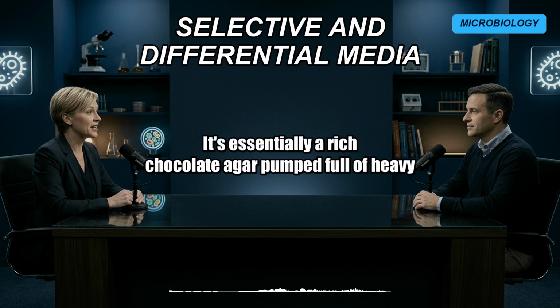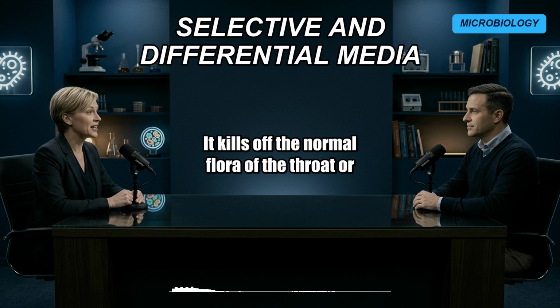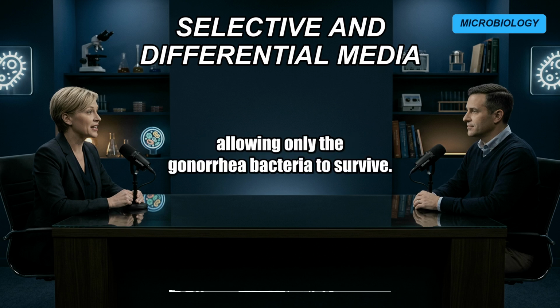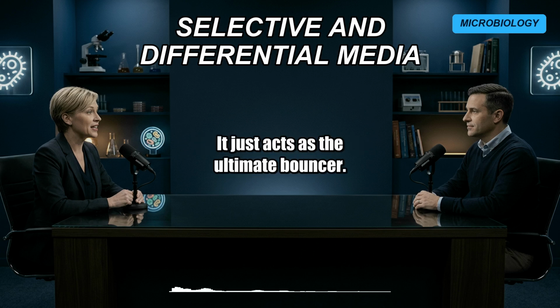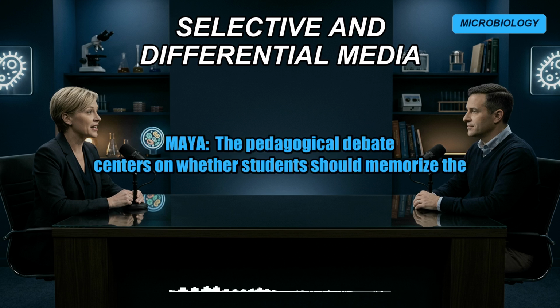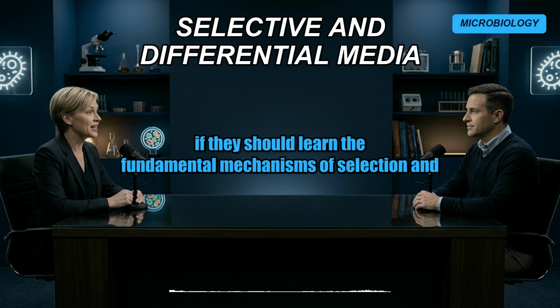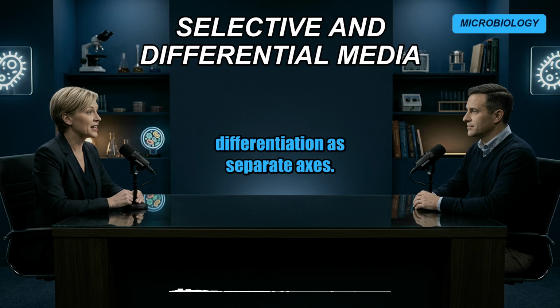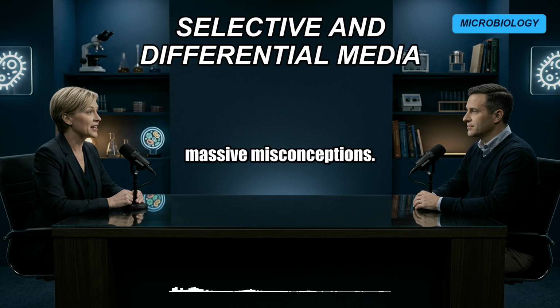It's essentially a rich chocolate agar pumped full of heavy-duty antibiotics. It kills off the normal flora of the throat or the urogenital tract, allowing only the gonorrhea bacteria to survive. But once it grows, there are no colored dyes. It doesn't differentiate anything. It just acts as the ultimate bouncer. Exactly. The pedagogical debate centers on whether students should memorize the specific combo plates they'll use at their lab bench, or if they should learn the fundamental mechanisms of selection and differentiation as separate axes. Understanding the mechanism is crucial because it clears up some massive misconceptions.